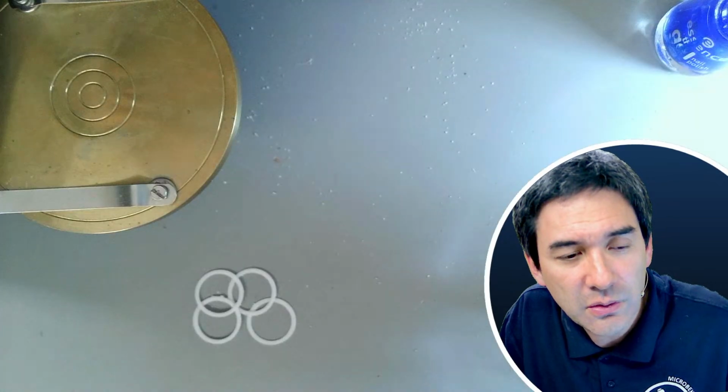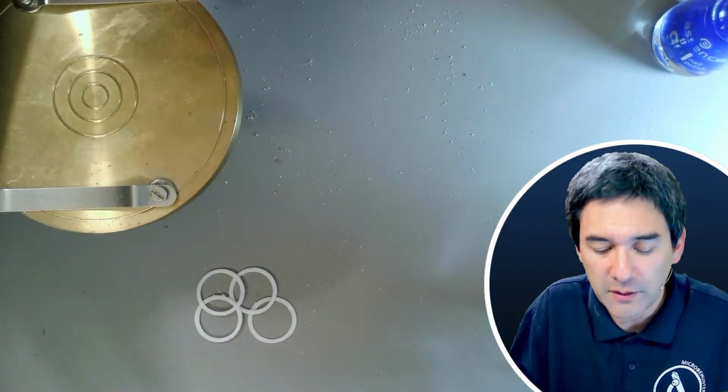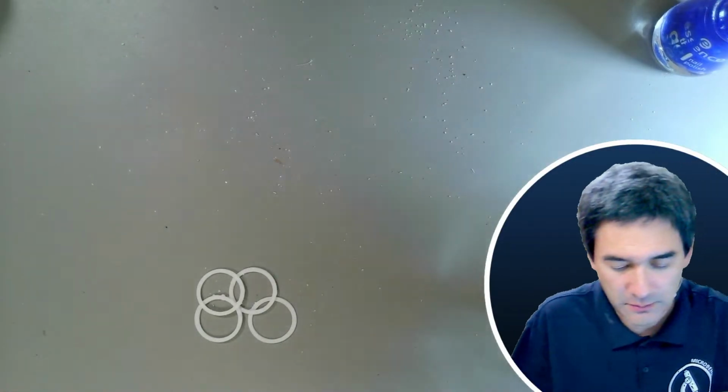But let's have a look at the other sand samples directly under the stereo microscope, just because it's so fun. What time is it? 45 minutes already. Okay, yeah, so let's have a look at some other sand grains here. Gotta clean up the mess here as well. So I'm going to move everything a little bit away here. Okay, and then let's have a look at the next one.